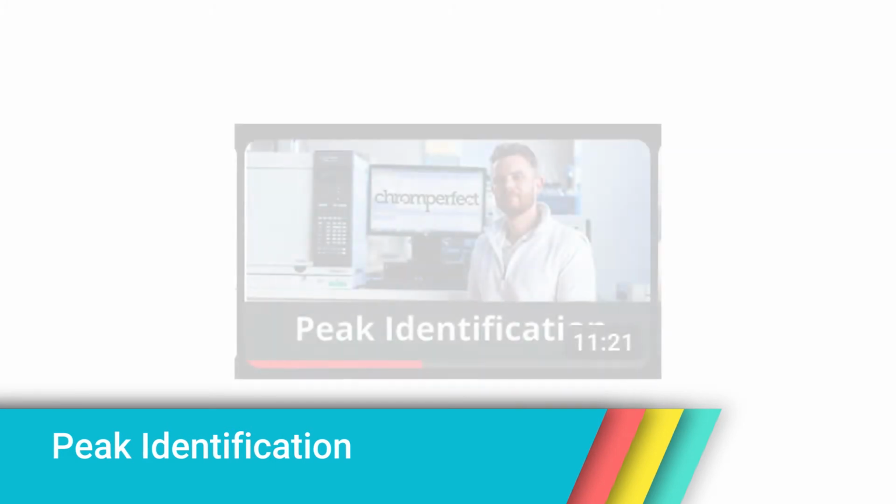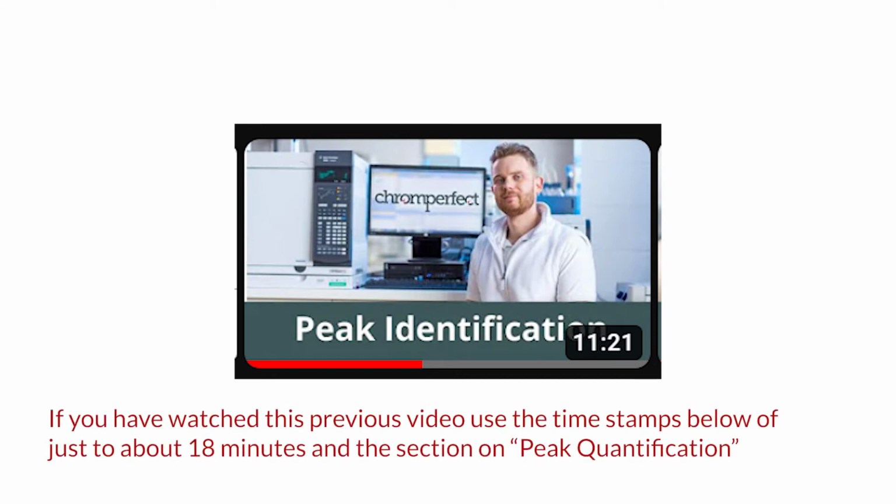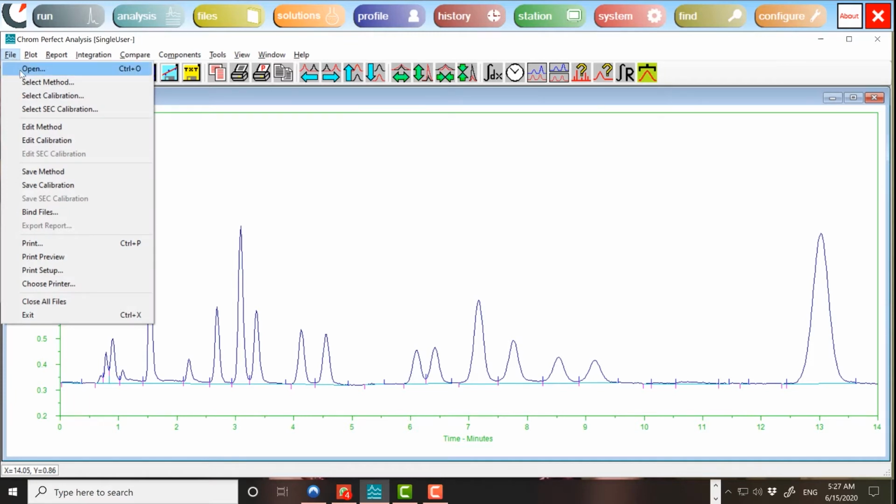Peak identification. The following section has already been published as a separate training video titled Chromatography Software, Peak Identification for GC and HPLC Analysis. Please use the timestamps below to jump to the next section if you have already watched this other video. The process of peak identification is straightforward.